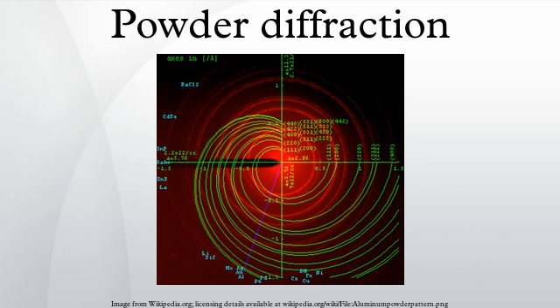This is particularly important in solid-state chemistry, where one is interested in finding and identifying new materials. Once a pattern has been indexed, this characterizes the reaction product and identifies it as a new solid phase. Indexing programs exist to deal with the harder cases, but if the unit cell is very large and the symmetry low, success is not always guaranteed.